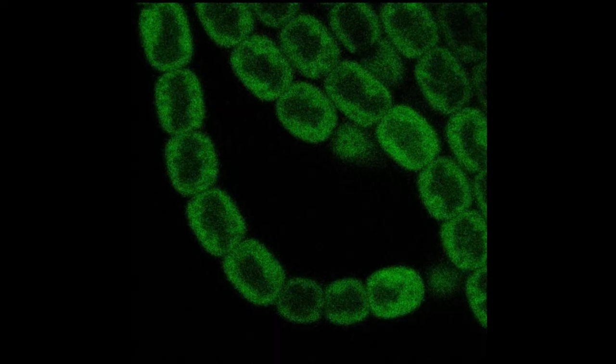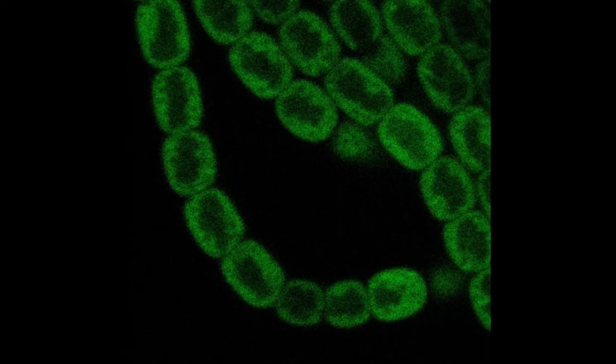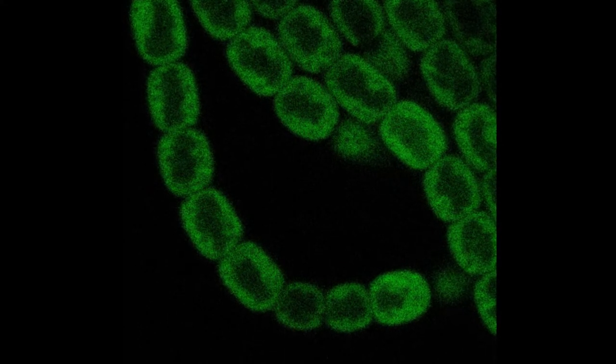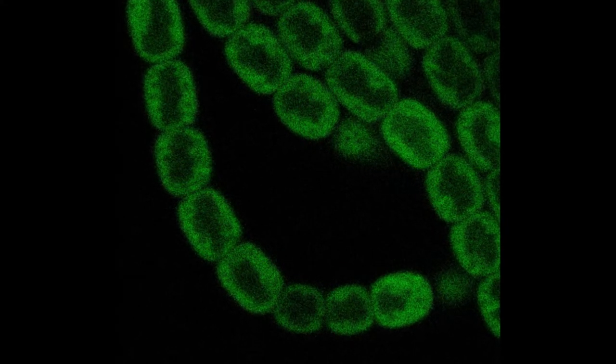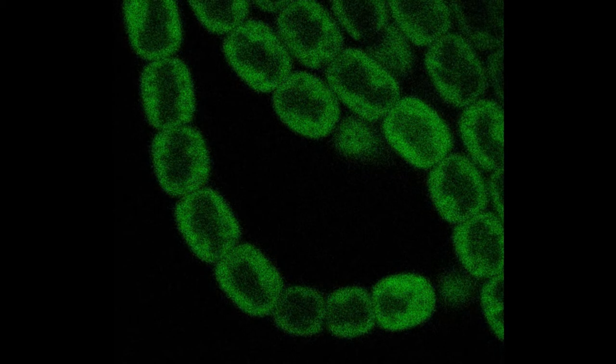This is a micrograph of a cyanobacteria taken by the Summers lab. The green color is a sigma factor that was tagged with green fluorescent protein to show protein localization.